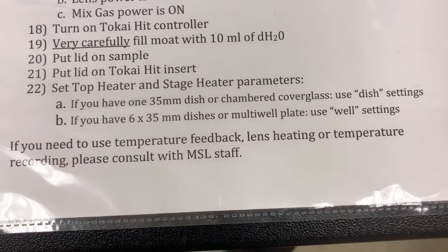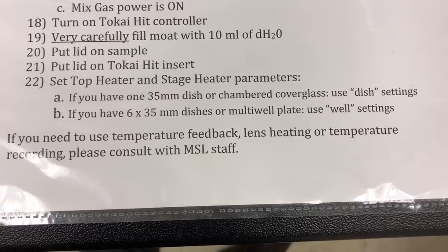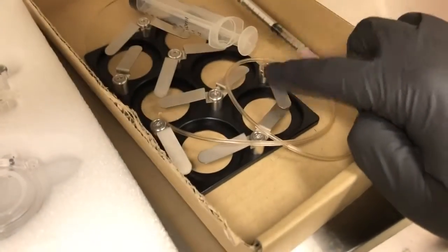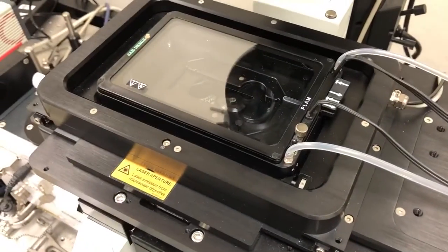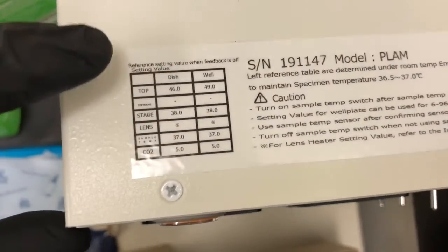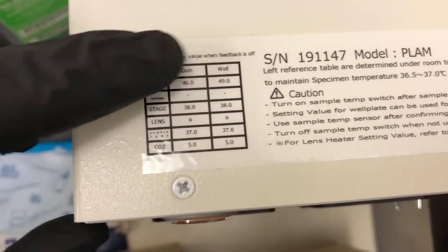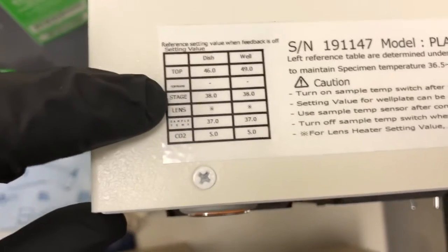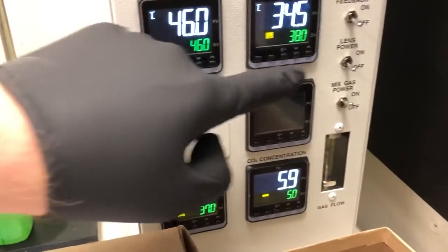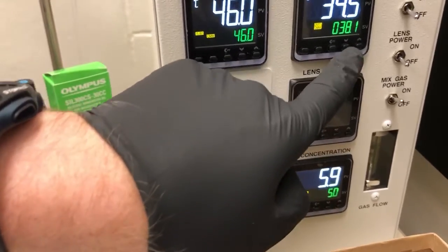The next step is to set the top heater and stage heater parameters. If you have one 35 millimeter dish or a chamber cover glass, use the dish settings. If you have six by 35 millimeter dishes or a multi-well plate, use the well settings. The six by 35 millimeter dishes refers to this holder — that's not what we have. We have a single chambered slide. Those parameters are in a small table on top. For dish settings, the top heater has to be at 46 and the stage at 38. If we wanted to change it, we could use these buttons here to change as needed.